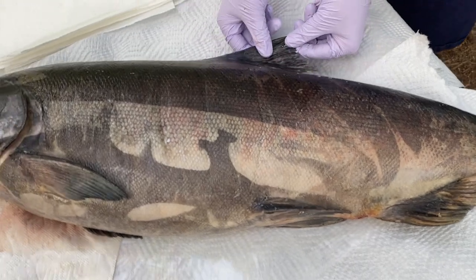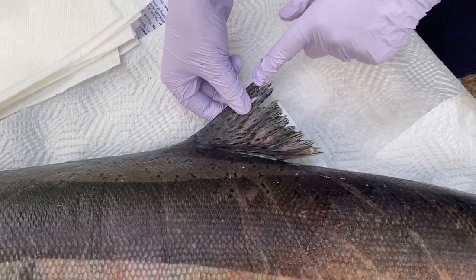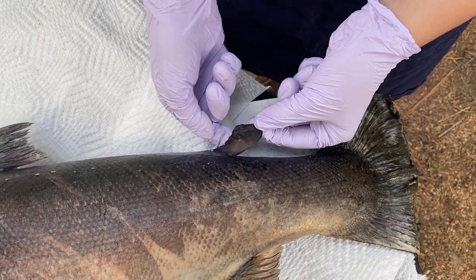And then we can go up the fish, and there's one long fin on the top that is called the dorsal fin. And then we have this guy right over here, and this is an adipose fin.